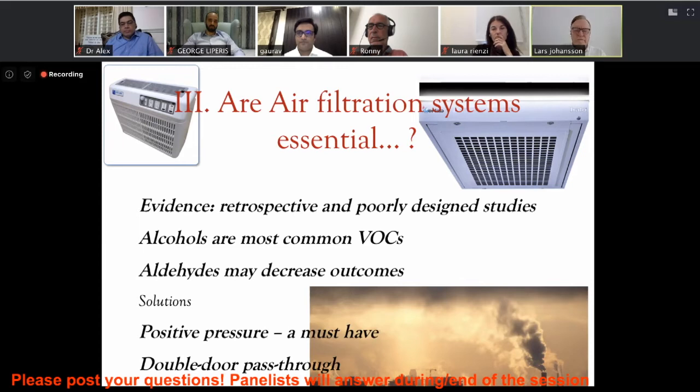there are so many different families and they have to be taken away in a multifactorial way. And the charcoal, they are holding back the contaminations. And then if it gets humidified or overloaded, it releases them again.